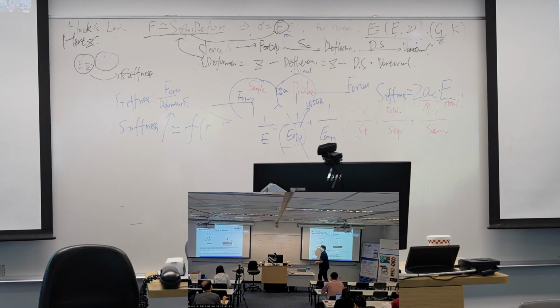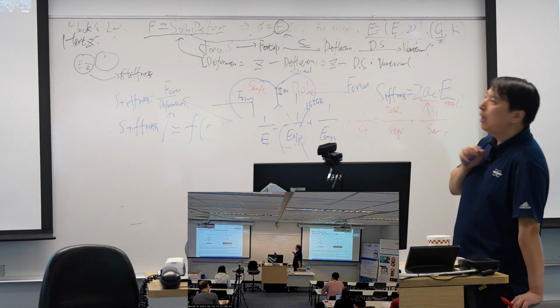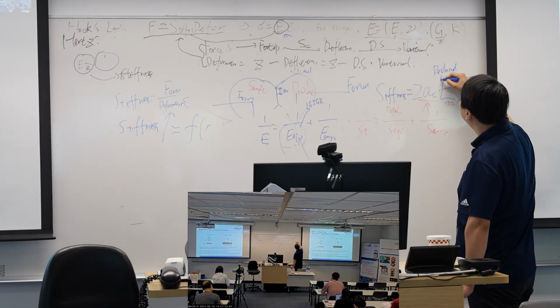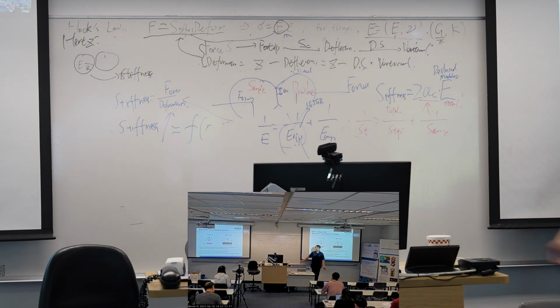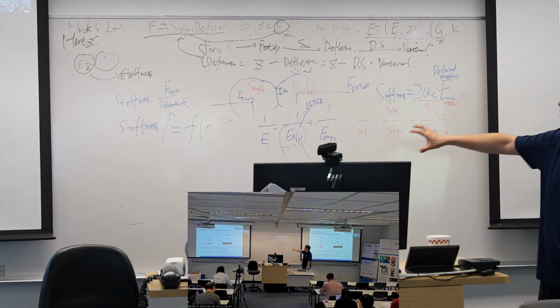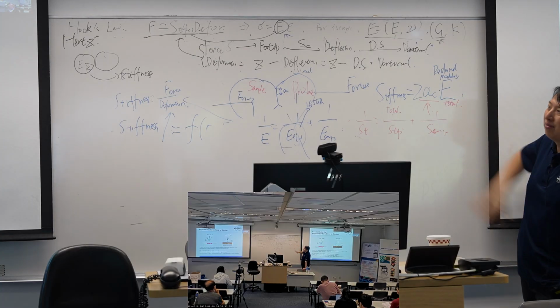That's our theory. If you check our manual, they will call it reduced modulus, or the total modulus of the serial connection of tip and sample. Okay, that's Hertz theory.